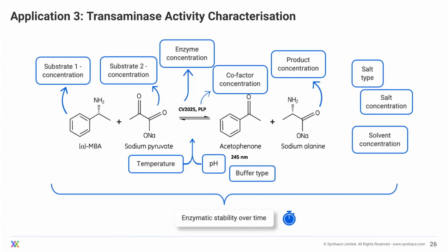So salt type, the salt concentration, the solvent concentration, if maybe you need solvent to solubilize your substrates. Then some process parameters, so temperature and pH, the buffer type that we use, and then looking at the enzyme stability over time in these reaction conditions as well.